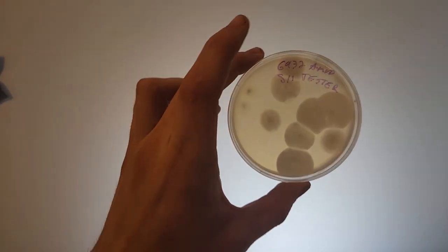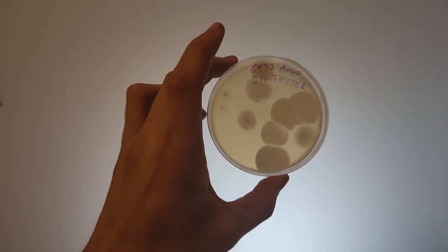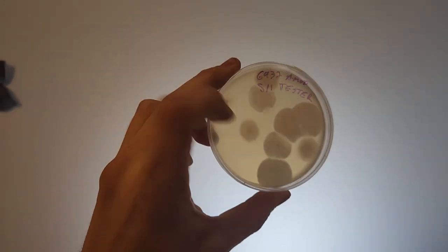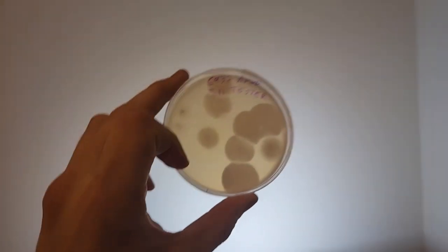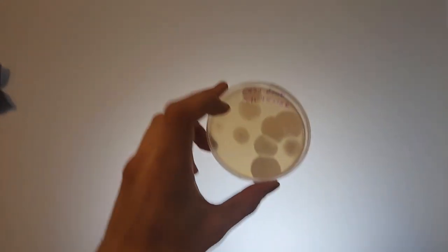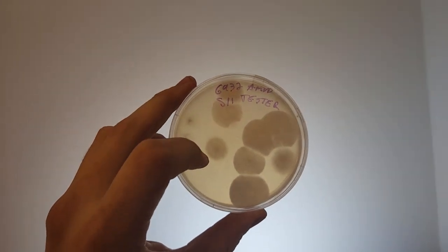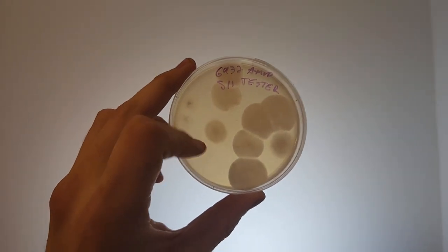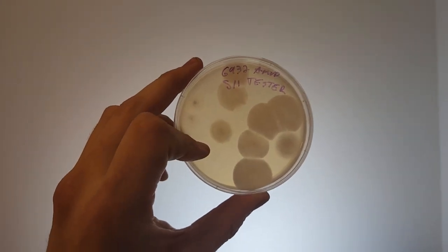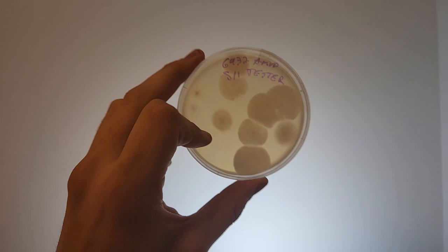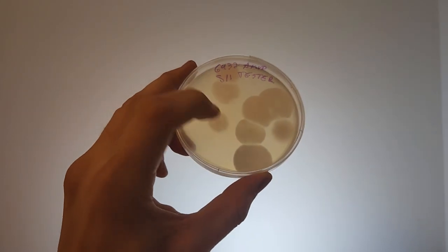If you don't know what a monocaryon is, when you're breeding mushrooms you want to select single spore germinations. They will have hyphae that only contain one nuclei and that's called a monocaryon.